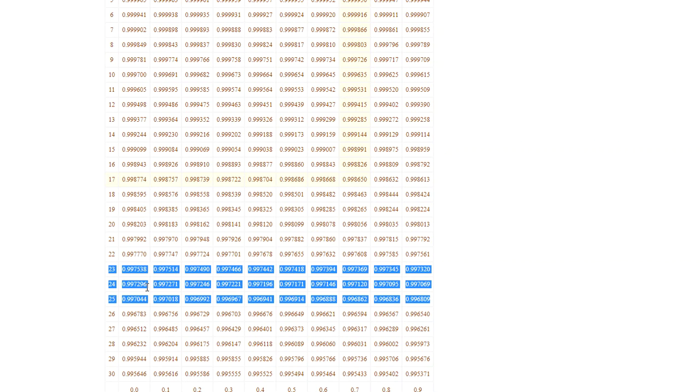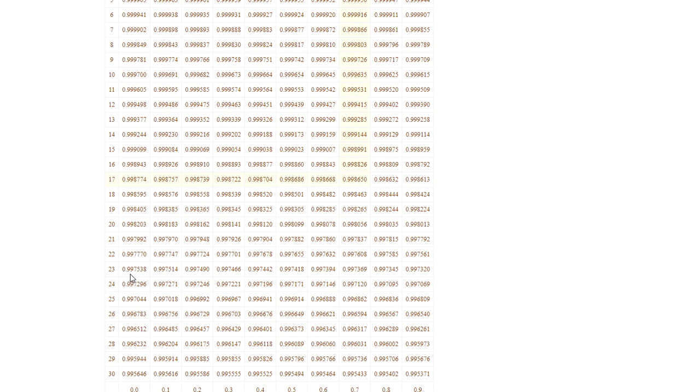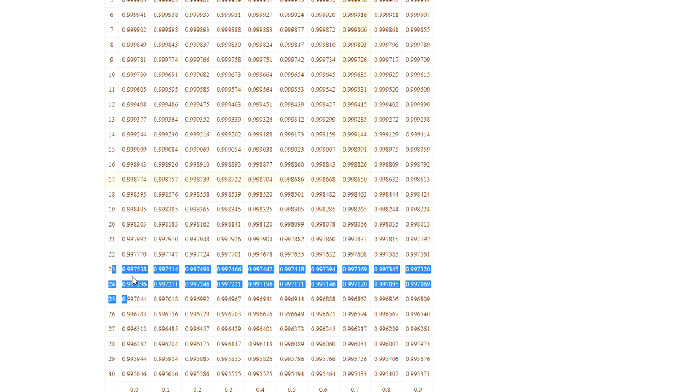Your book in the procedure will reference 0.997. And you kind of know why they do that. Look, 23 degrees, 997.5, 25 degrees, 997, and typically room temp will always gravitate toward those couple of different temperatures. So 23, 24, and 25. So now you know where that number is really coming from.